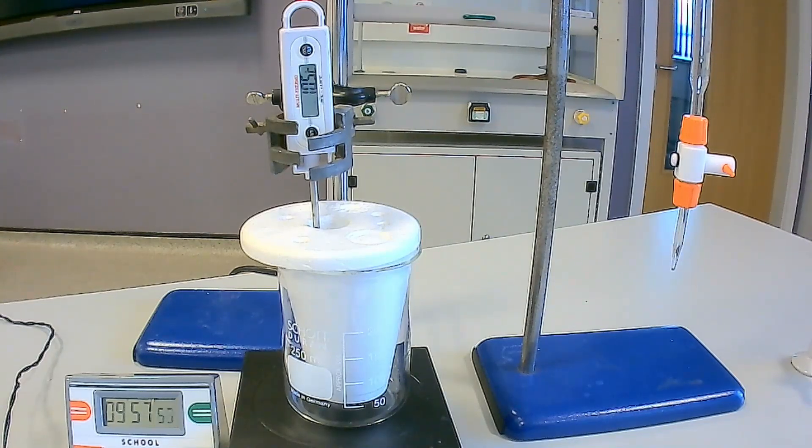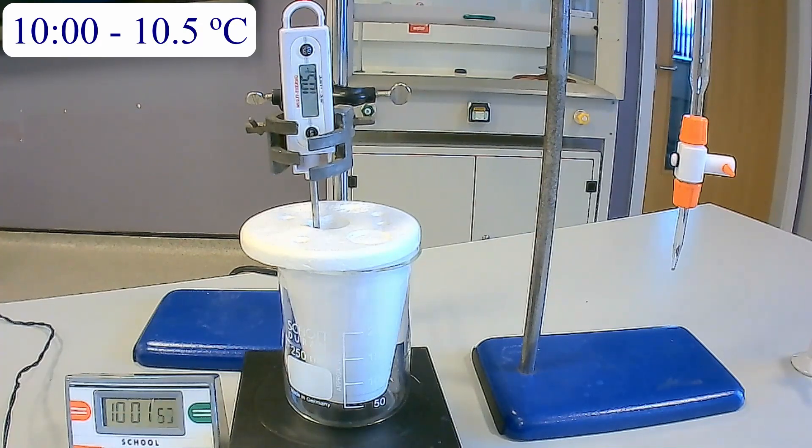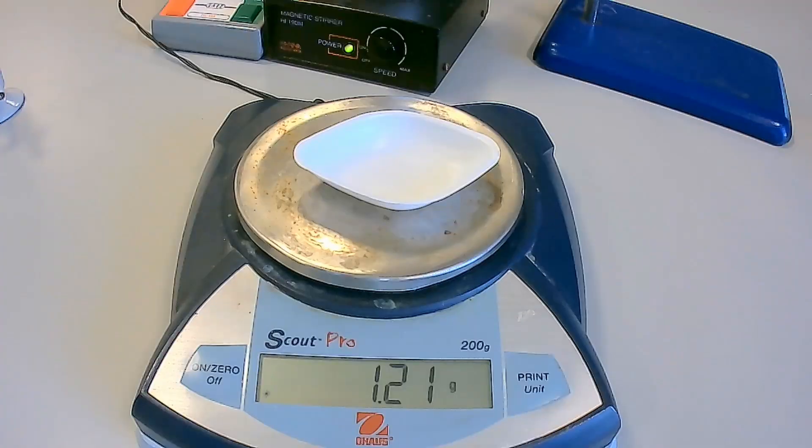At 10 minutes, you have finished recording the results and you can stop this experiment. Ensure that you record the final mass of the weighing boat after transferring the sodium hydrogen carbonate to the polystyrene cup at 4 minutes.